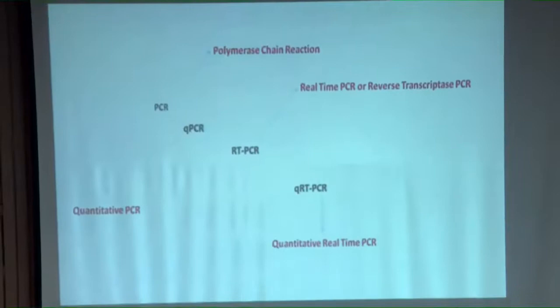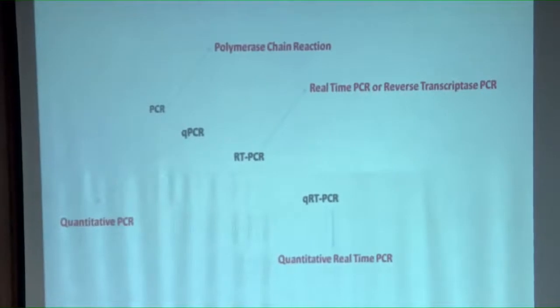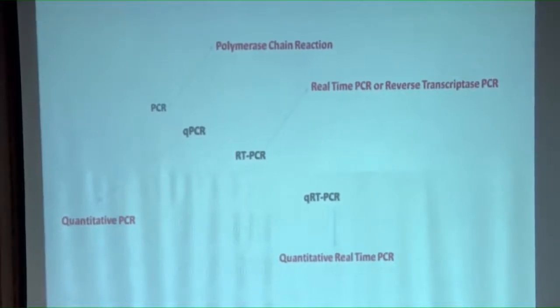And we have another terminology, another acronym, RT-PCR. What is RT-PCR? It's really confusing. You really don't know what the literature is going to speak about. Either it may be real-time PCR, or sometimes it may be reverse transcriptase PCR, right?